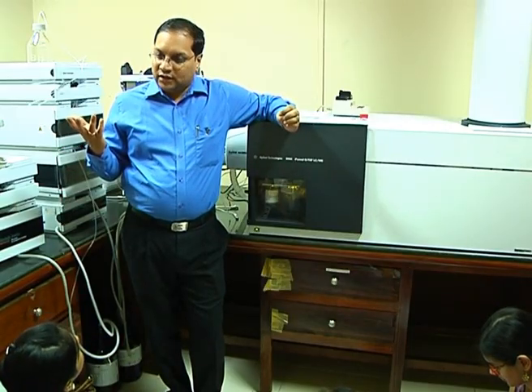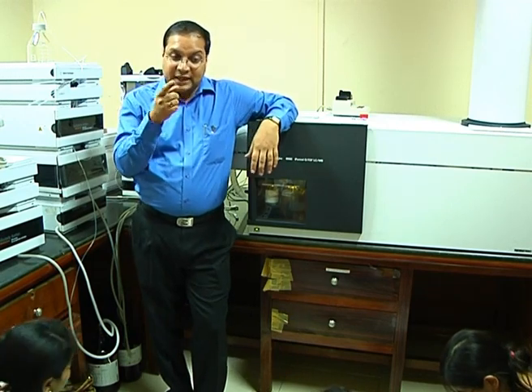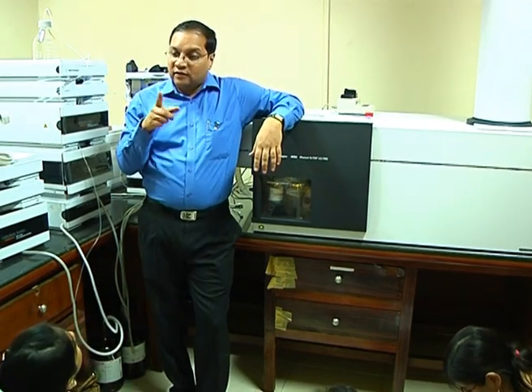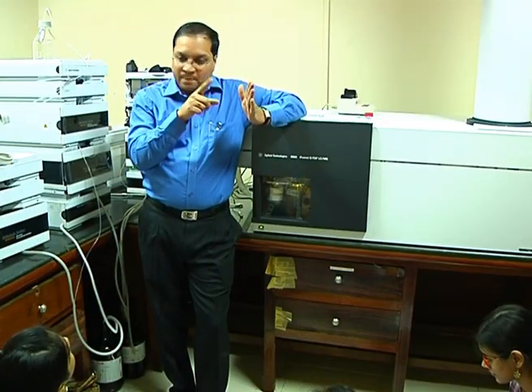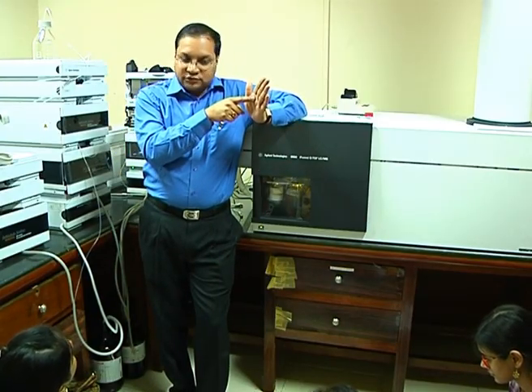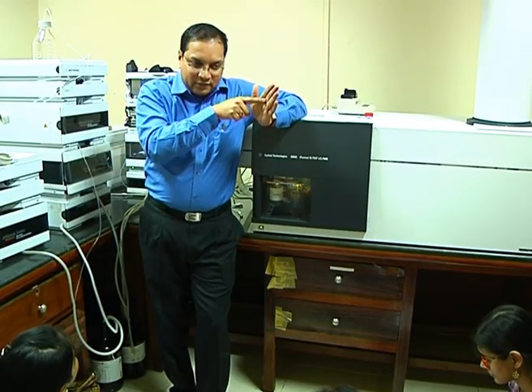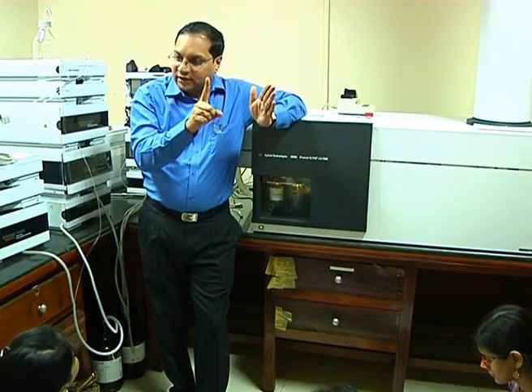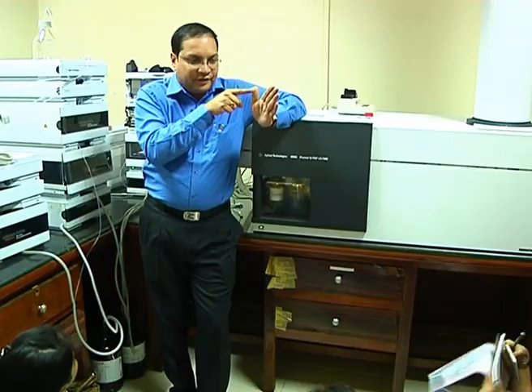If my TOF is scanning 1 spectrum per second, meaning my cycle time is 1 second, it will start from 5, come to 3200 and come back. It will take 1 second to scan completely whatever I define.